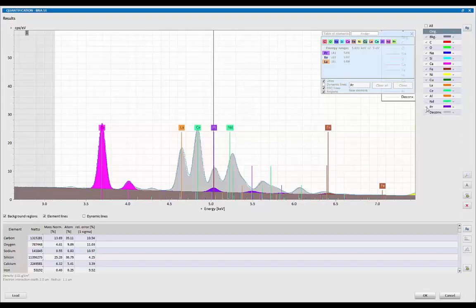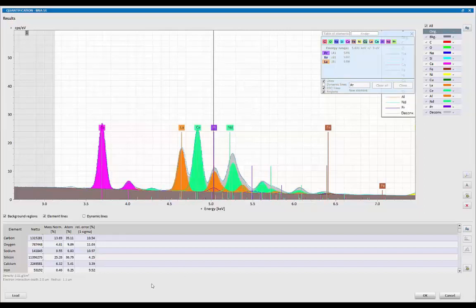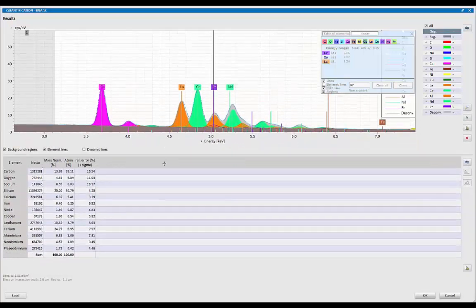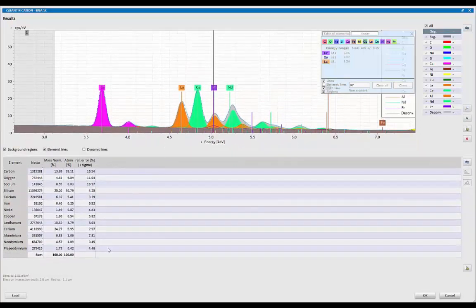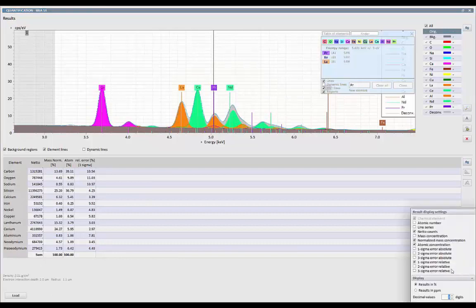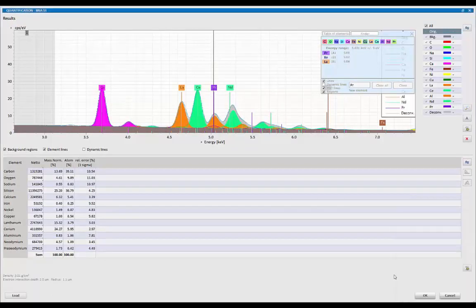So the overlap in itself was praseodymium, neodymium, cerium, and lanthanum. It has also updated my quant data. So now my results are changed. And if I want to add more information or select more information, I can.